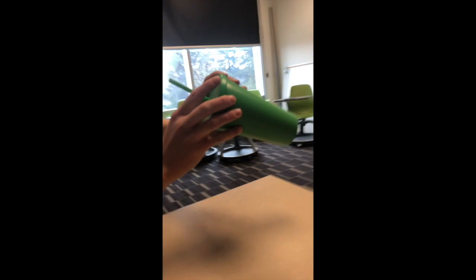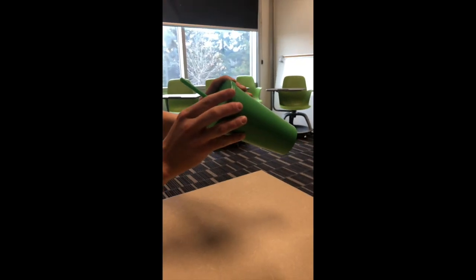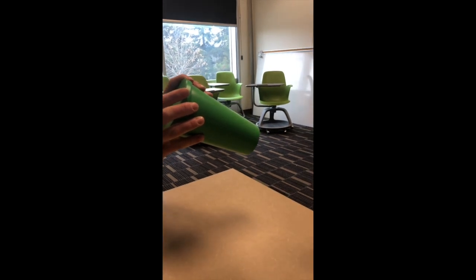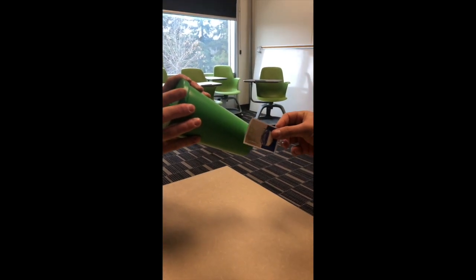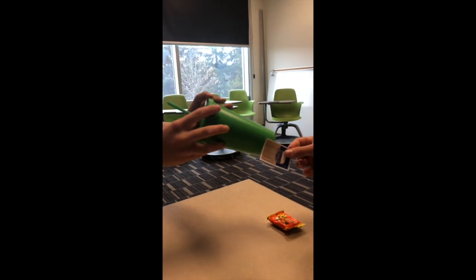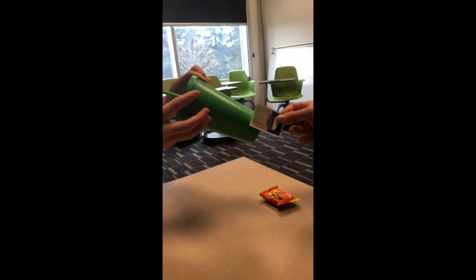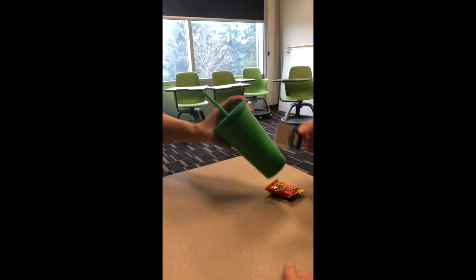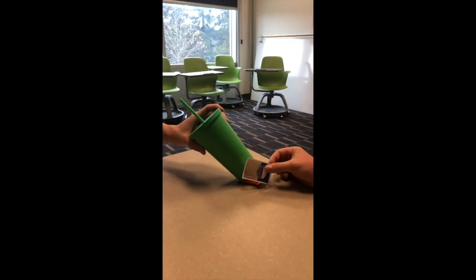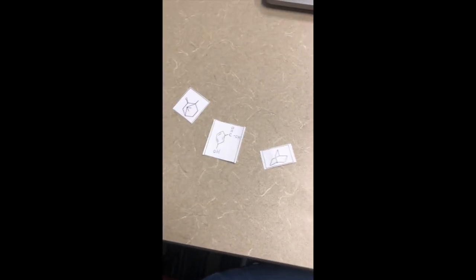So now we're going to attach the vacuum and then the flask, and we're gonna make it rotate. And if it starts getting foamy, we could put it in the hot water bath. The solid is collected in the round bottom flask. So now we have successfully separated all 3 of our compounds from each other back into their solid form.